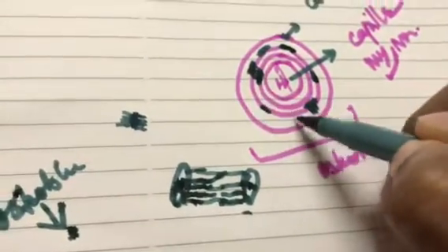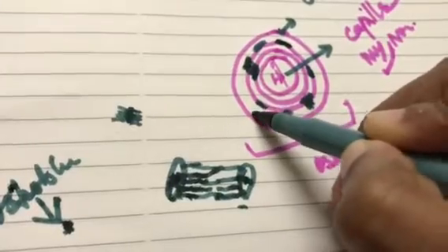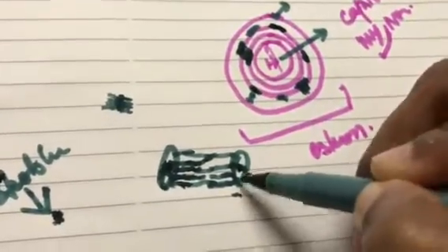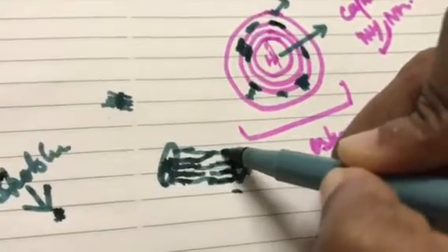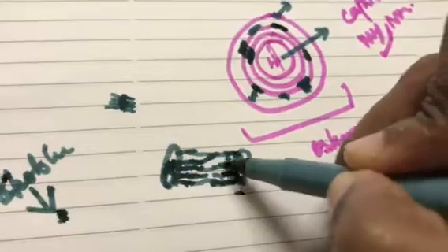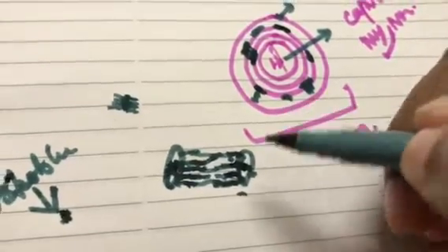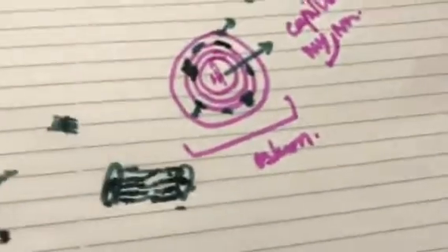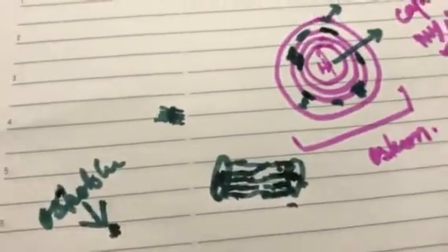So we'll ask, what is this? Number one, lacunae. Number two, what is there inside the lacunae? Osteocyte. Number three, what are these processes? These are all canaliculi. What is present inside the canaliculi? The osteocytic processes are present inside the canaliculi. What is the role of the canaliculi? It transmits the nourishment from one lacuna to the other lacuna. Finished. So this is about one osteon.